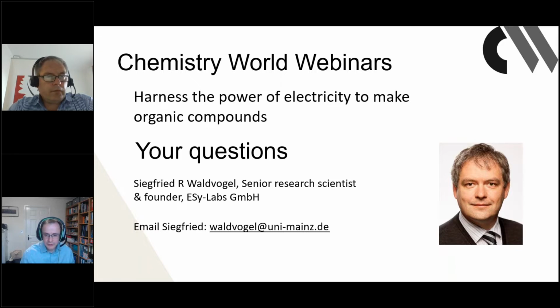Maybe also very important, a quick version. If you have a graphite electrode and you get it from your colleague and it's maybe a more porous graphite, there could be some molecules inside from your colleague's reaction, which makes the first trial a little bit difficult because you find molecules you never anticipated. Keep that in mind. Therefore, taking off some microns from the graphite electrode with sandpaper avoids that, just as a hint.